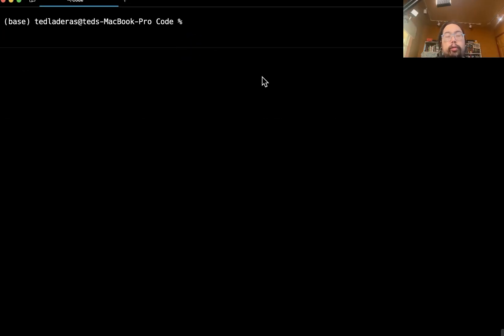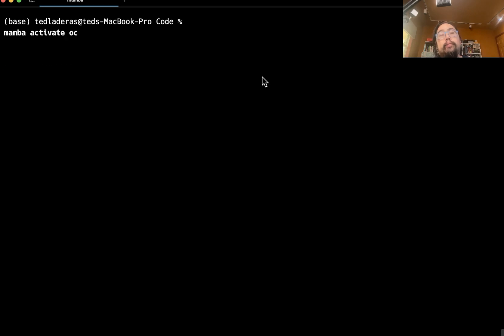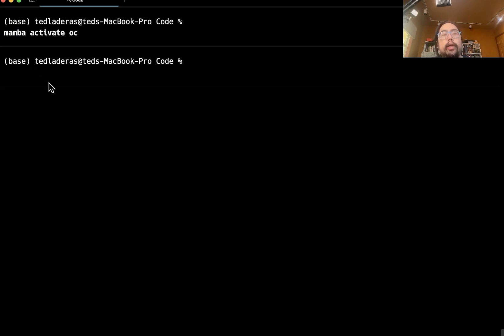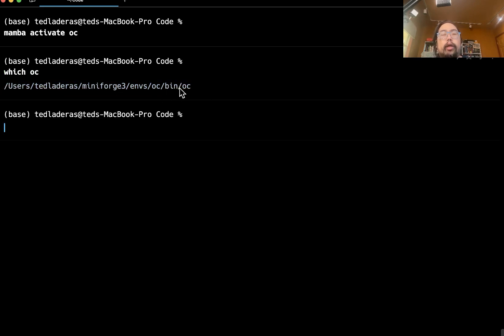So I've cleared my screen. And now I'm going to activate that OC environment that open cravat is installed into. So I'll do a mamba activate OC. And unfortunately, there's something going on with my terminal. So this hasn't changed to OC. But if you do a which OC, you'll see that open cravat is installed in the environment.